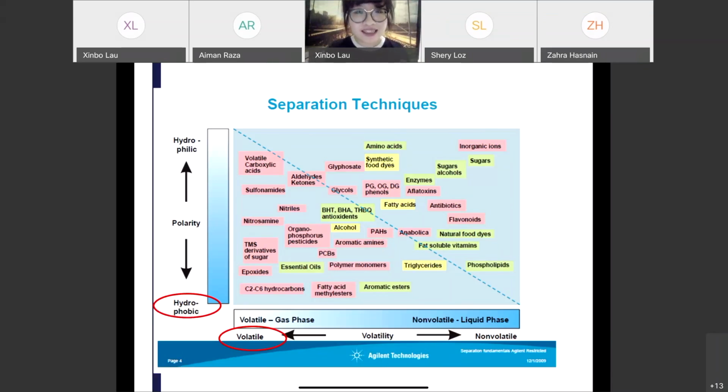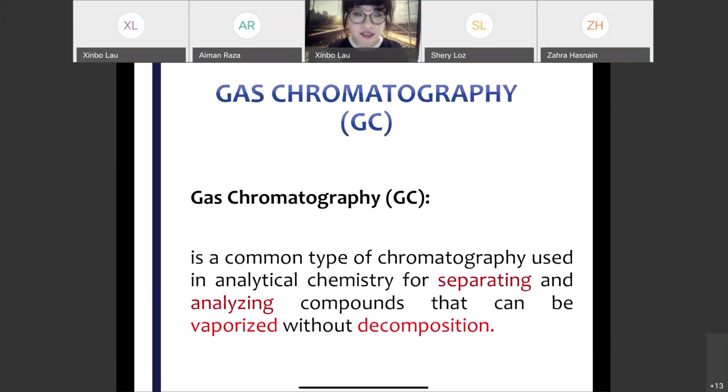If it's that huge, such as an amino acid, if you see on the top again, sorry, I cannot highlight on it, or for a complicated compound, if it has high molecular weight, then it's probably not easy to turn into gas phase. Okay, so that's just something about that.